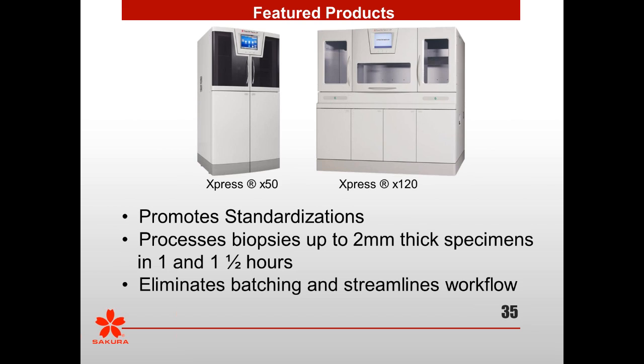And our final question for today is, what solution do you use to extract impurities? Low-grade alcohol? If so, what percentage? It's an isopropyl alcohol mix, and I happen to also use a proprietary solution from Sakura. It's a pre-processing solution. And correct me if I'm wrong, Alicia, its majority is isopropyl alcohol. But using pre-processing, all alcohols will start to extract those lipids and impurities. And again, it's a matter of multiple changes and how rapidly you want to do that pre-processing.